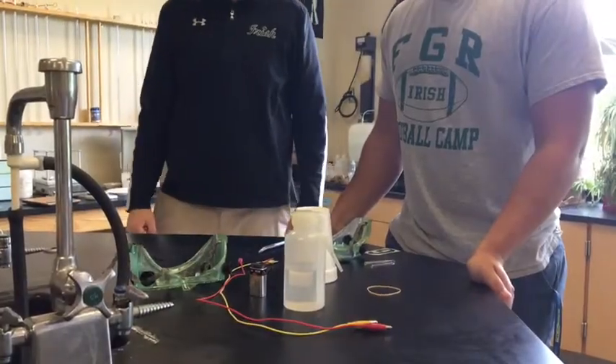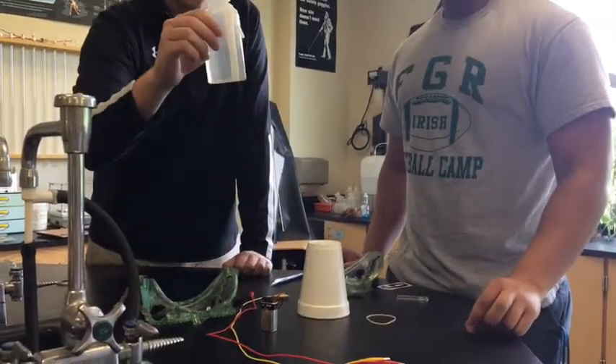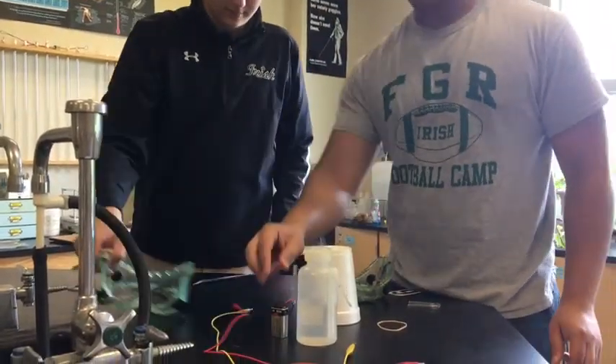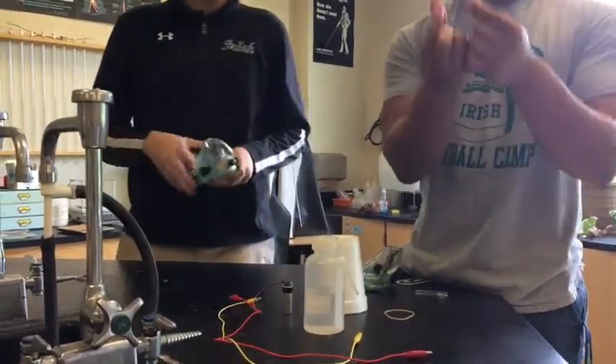We will be doing the electrolysis of water in this lab. You need a U-tube, rubber band, DI water or distilled water, two wires, a battery with a cap on it with the wires coming off, and two pieces of graphite to use as electrodes.